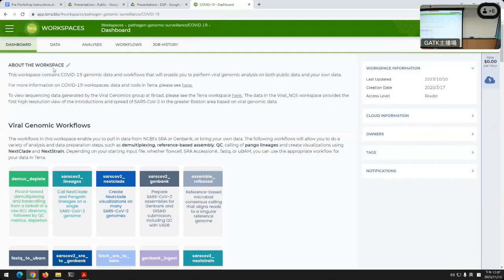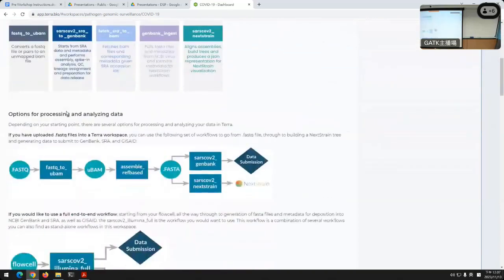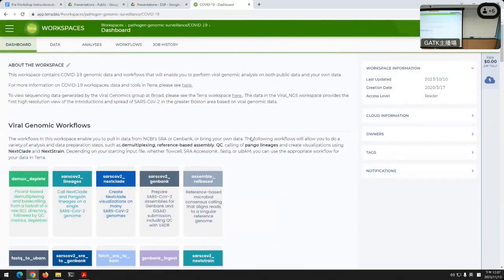That's what this giant markdown space is on the left here. And when we clone our own version, I'll show you how that's an editable space, but it's really just one big markdown field.